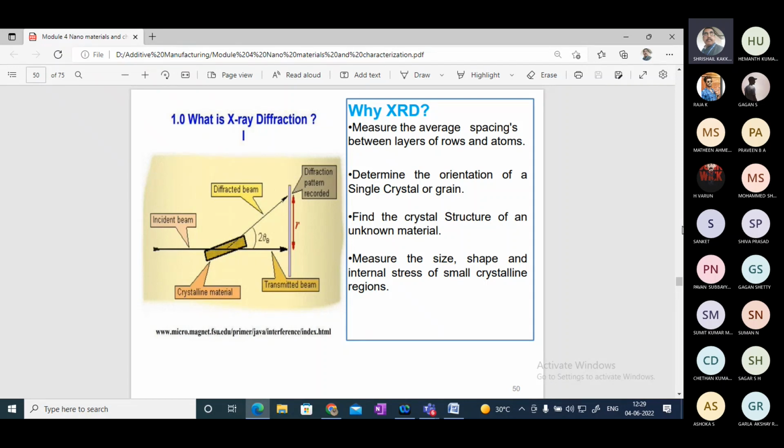The average is first, second, and third added together and divided by 3. In a similar way, the average cluster of the particles spread over the sample can be estimated. That is also possible. It all depends on what the person requires, and based on this we set up the input data.